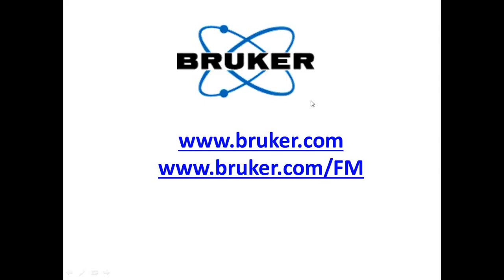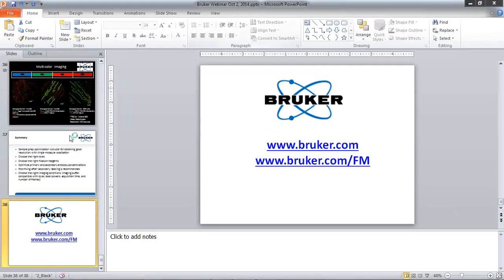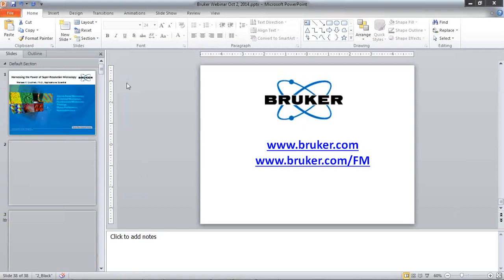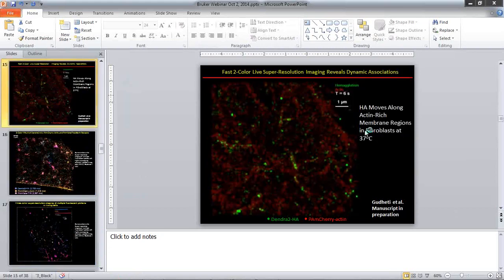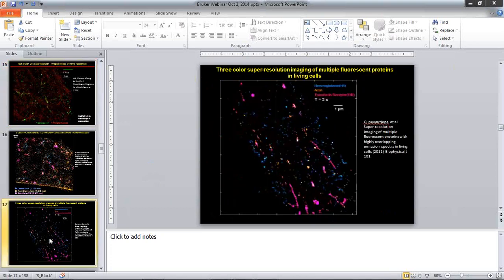Okay. So this is back to your presentation. The question is, was the fibroblast example live cell? And then what about the second example? So I guess that means the image or the slide after the fibroblast cell. Were those live cell examples or were those fixed? Okay, let me just pull it up. Oh, these ones, yes, those were live cell. Okay, and the one after? These were live cell as well, yeah. Okay.